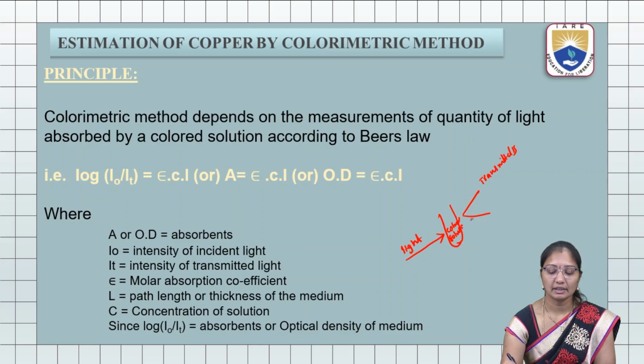The light passed from this solution will have less intensity, due to the absorbance by the compounds or chemicals present in the water sample.